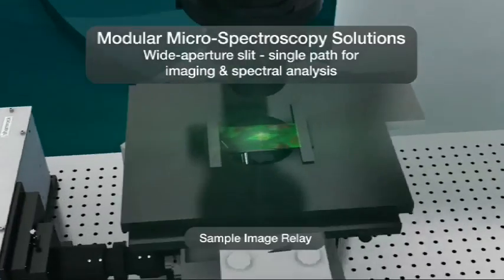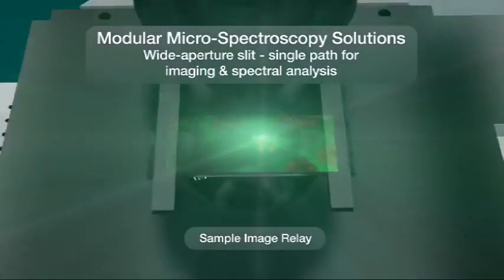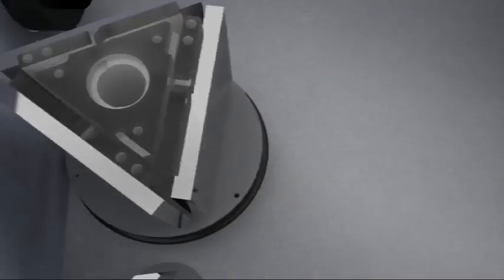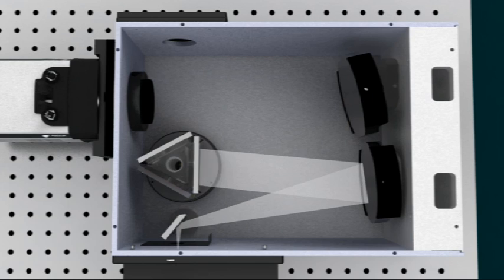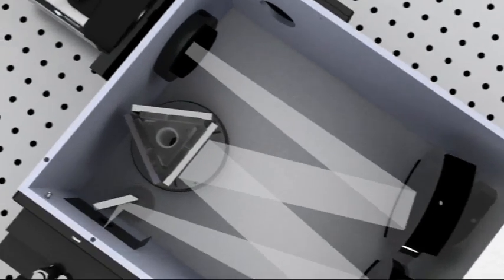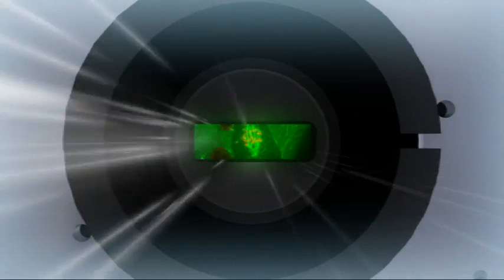In imaging mode, light travels from the sample to the spectrograph where the entrance slit is set to wide aperture mode, typically 12 mm. A flat mirror or grating is used in zero-order position to relay the undistorted sample image to the detector, allowing real-time positioning and selection of the sample area of interest.